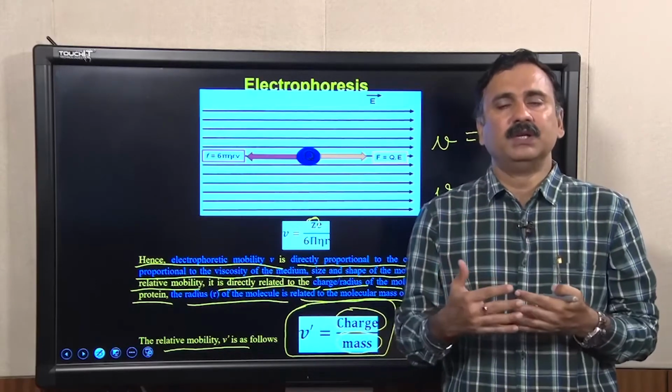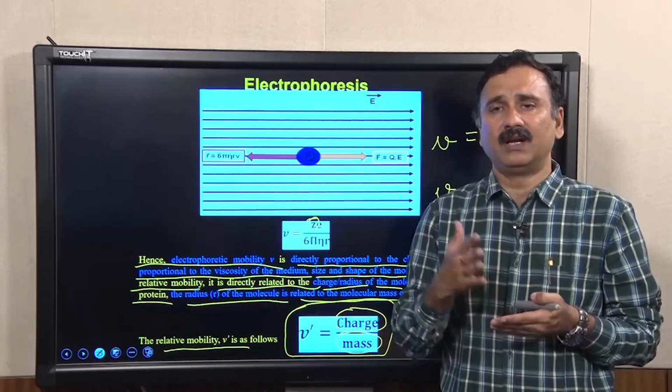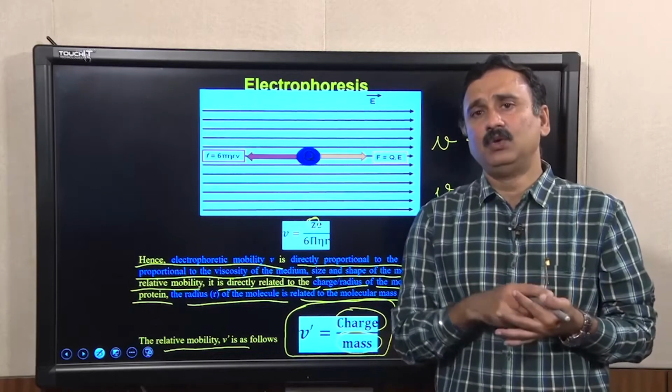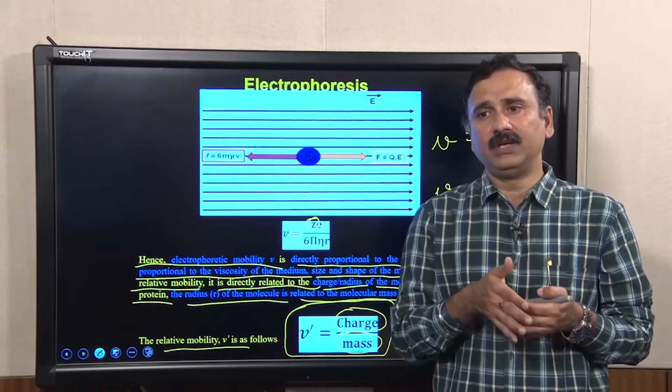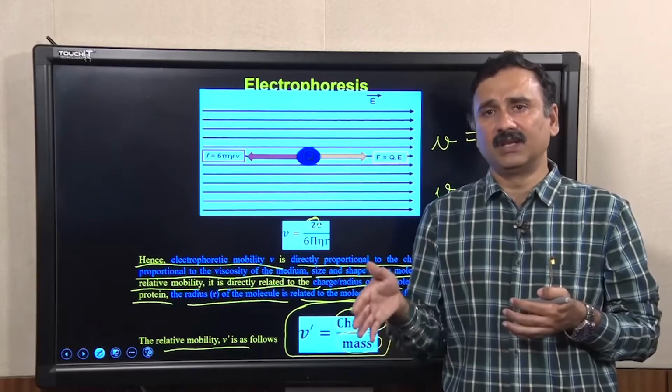So, for resolving the molecules, they have designed different types of electrophoretic apparatus, because what you are supposed to understand is that you are interested in doing electrophoresis, but you are not interested in doing electrolysis.